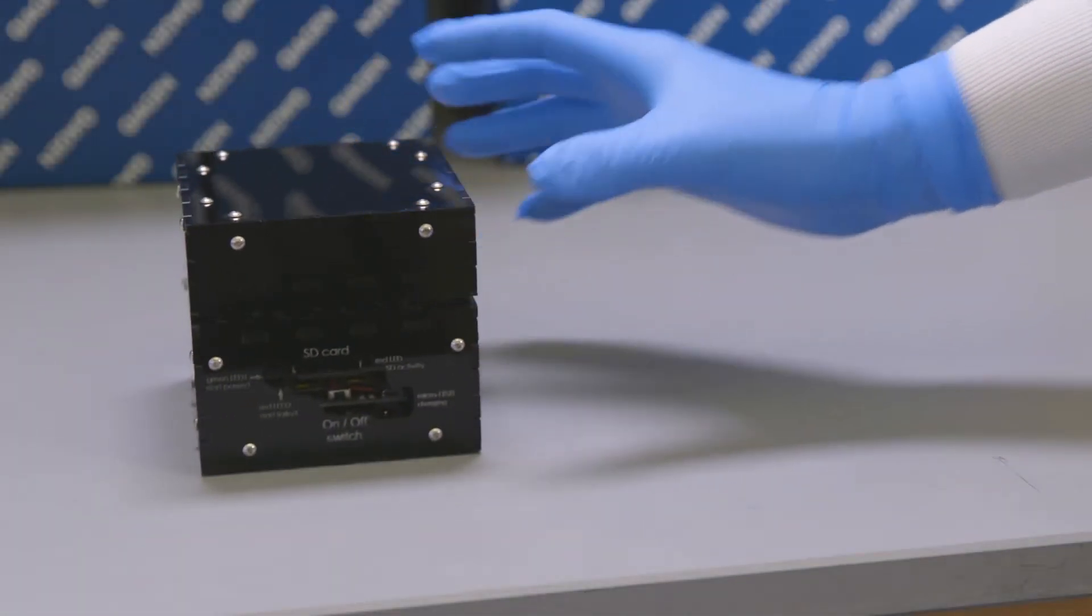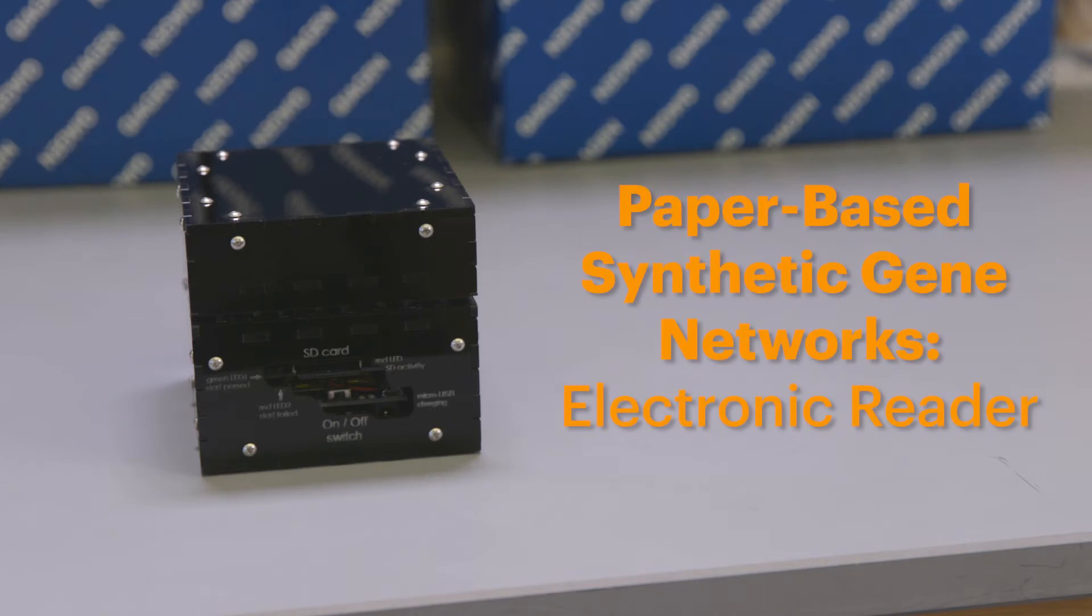The electronic reader serves as a companion device to our diagnostic reactions. It provides a low-cost, portable way to quantify the output of our toehold sensors.